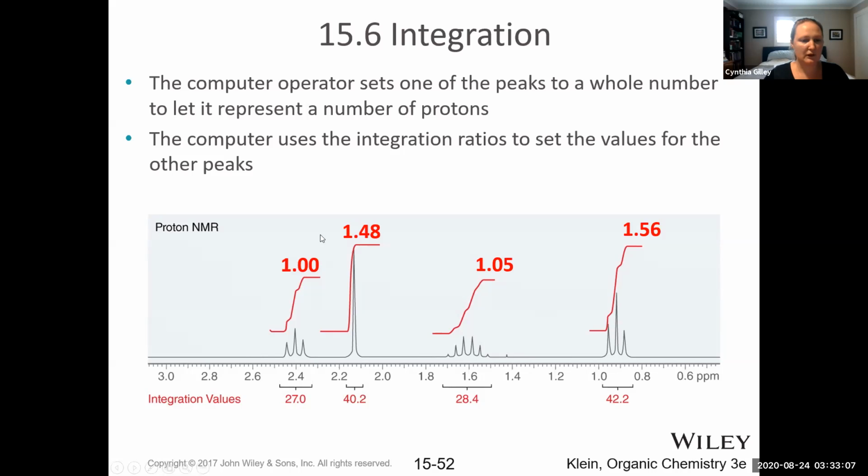What we're looking for is whether or not these are whole numbers or very close to whole numbers, because there's always some error associated in these calculations. What we see is that we are not looking at whole numbers, because this is close to 1.5 and this one as well. So we can multiply by a number to get whole numbers for all of them.